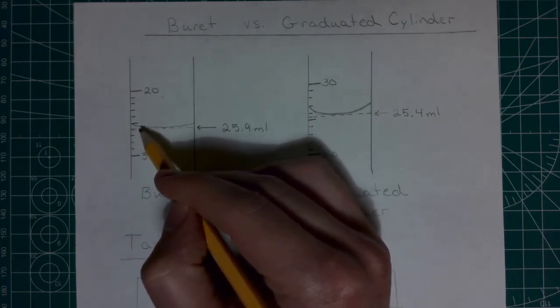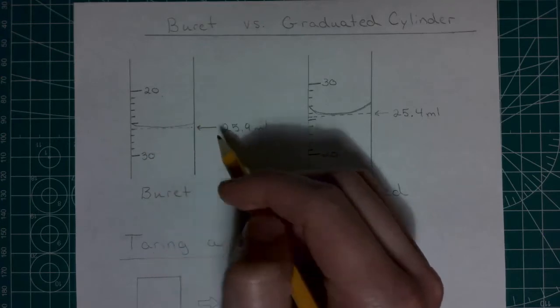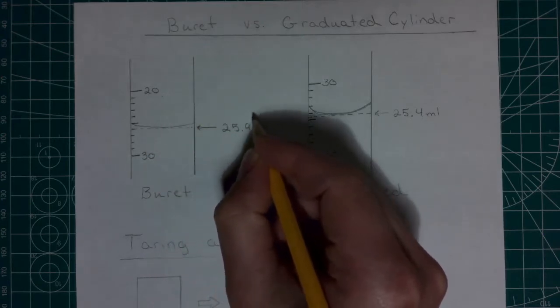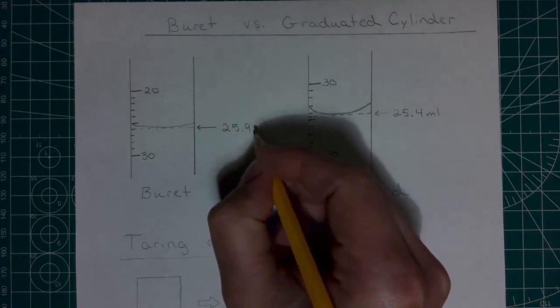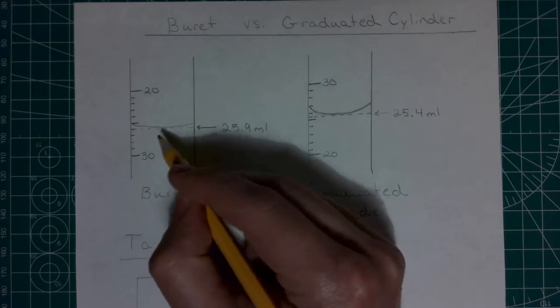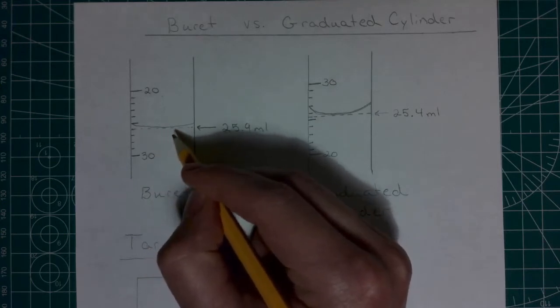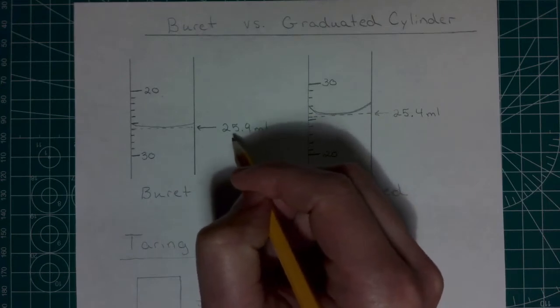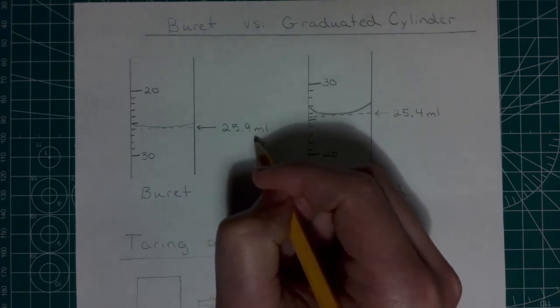We can see we didn't quite make it to 26 here. The bottom of our meniscus is just almost there. So we're going to go 25, and we're going to guesstimate this last value. Your last digit here will be one that you do not have a line for, an actual marking, but just that you're going to kind of guess that it's close to something. So here we're going to do this as 25.9.